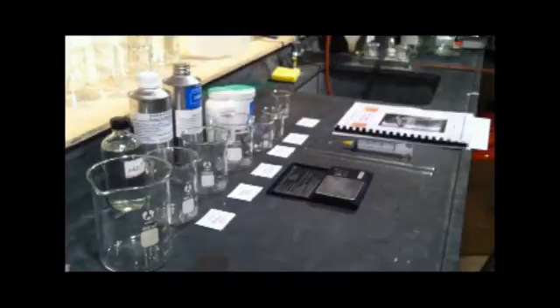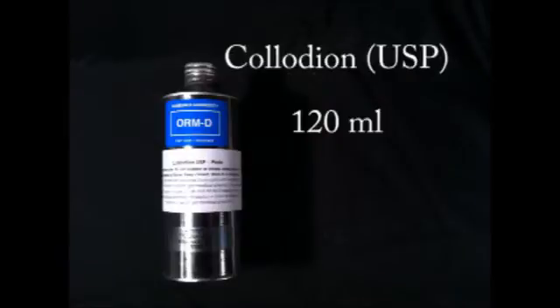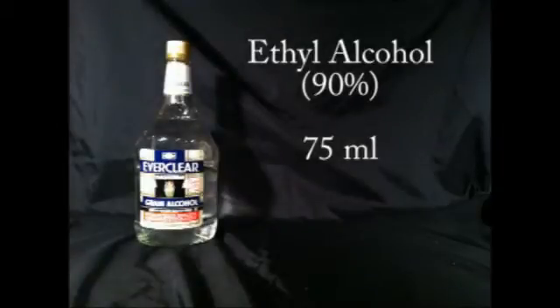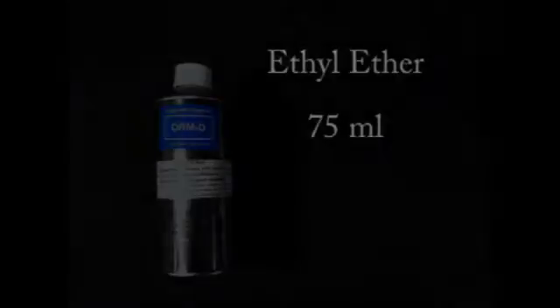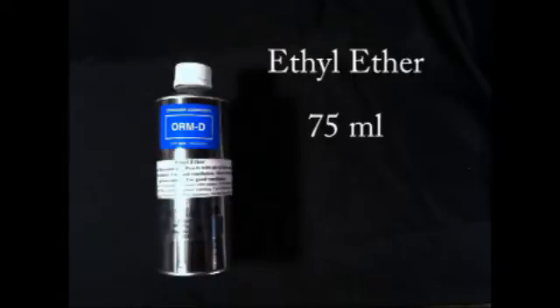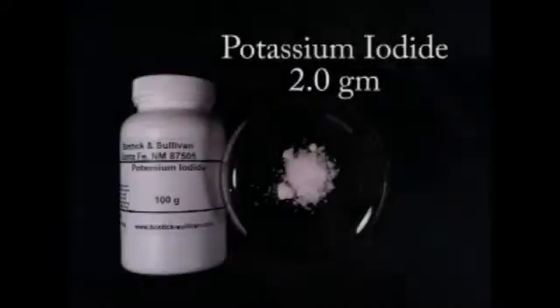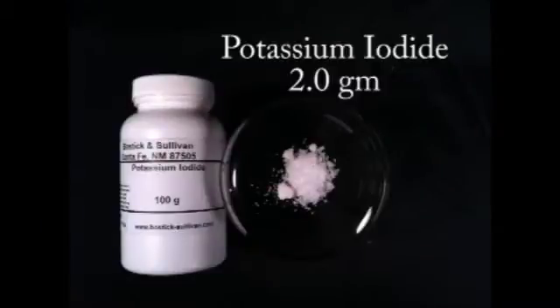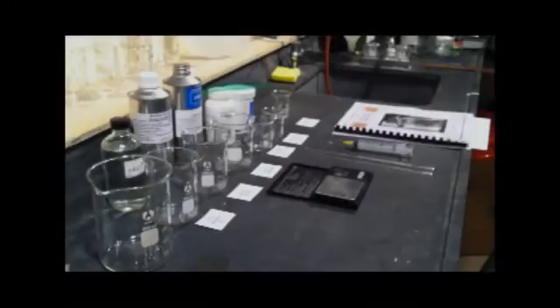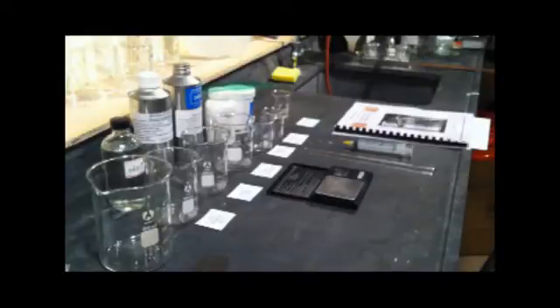The recipe that we'll be using is plain USP collodion 120 milliliters, ethyl alcohol 75 milliliters, ethyl ether 75 milliliters, cadmium bromide 1.5 grams dissolved in 2 milliliters of water, and potassium iodide 2 grams dissolved in 2 milliliters of water. We're only using enough water just to dissolve the powders. Too much water in the collodion will cause problems later on.